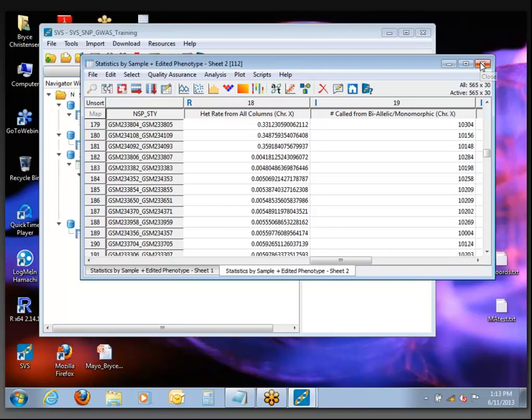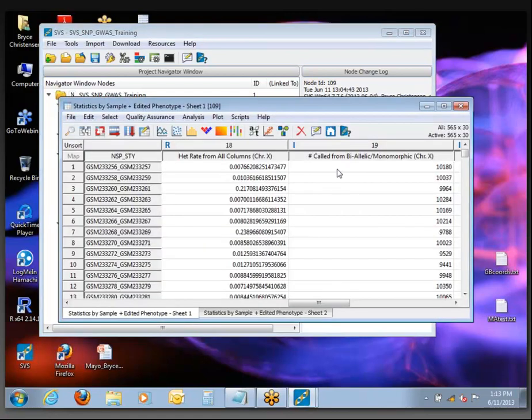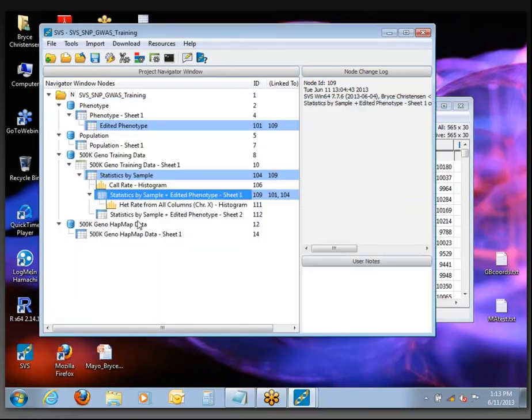As you learn the software more, you'll realize that if you want to go back and make another plot from this data, go back to sheet 1 — you can still make more plots from it without creating a new node. As soon as you make a plot based on sheet 2, that one will be frozen, and the next time you sort it, it will create a new version. It's something we get questions about all the time — how to minimize the number of new spreadsheets being created.